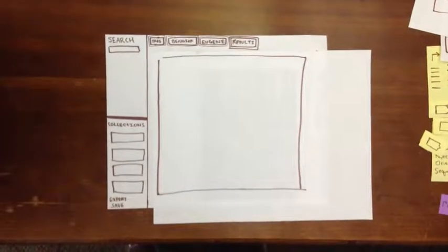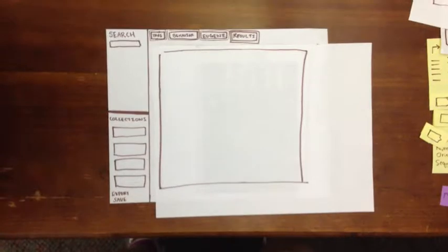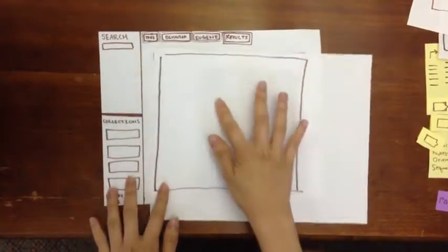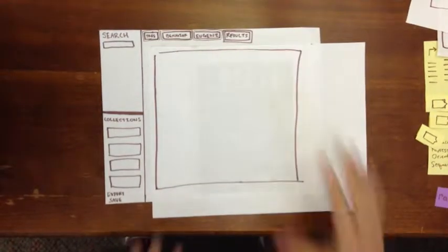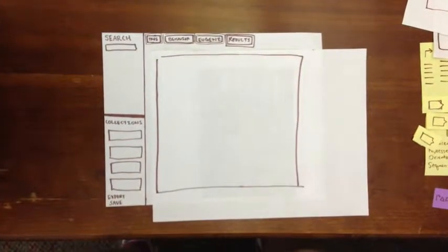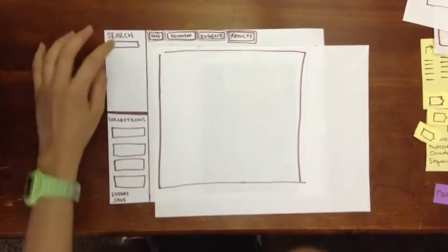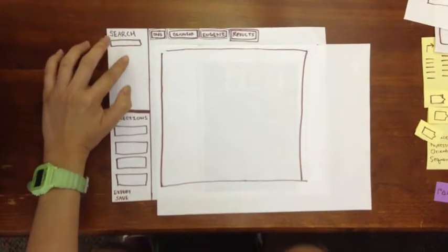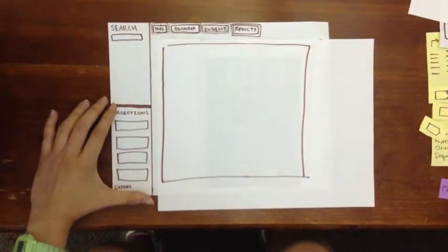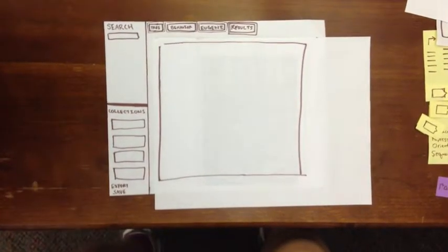This is the Eugenie Surface app that will be displayed on a Microsoft Surface table and respond to motions such as touch and dragging. So here we have the workspace where you build the system of devices or device that you want from parts or devices that you click and drag from the search field here. Or you can add parts and devices from collections that you've built previously.